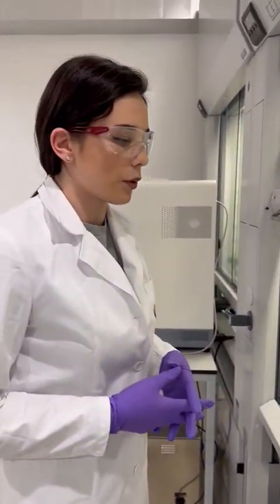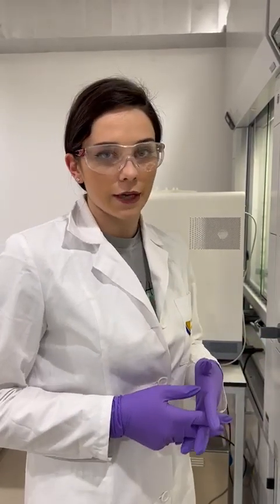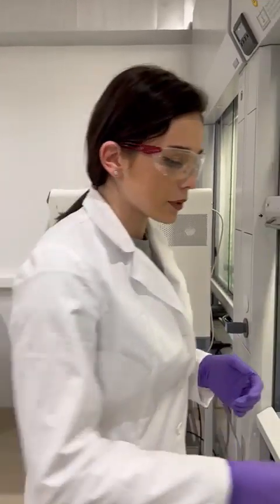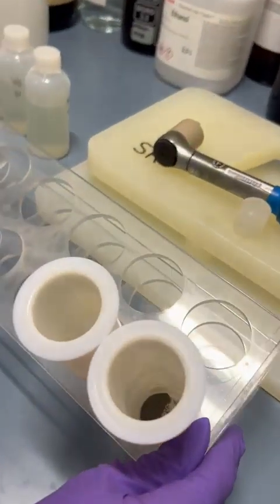We are weighing approximately 0.25 grams of our samples into the microwave vessels. This is how it looks.